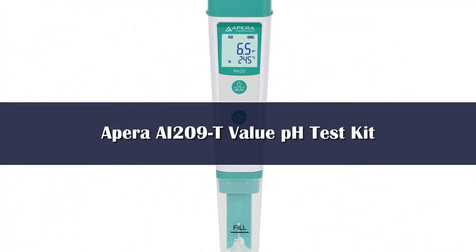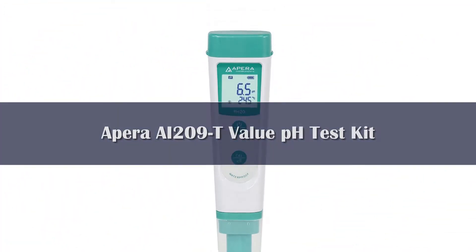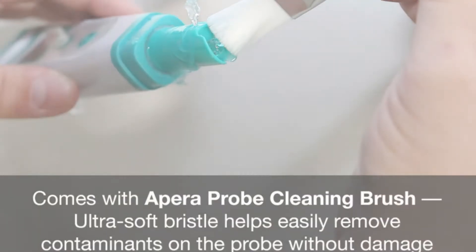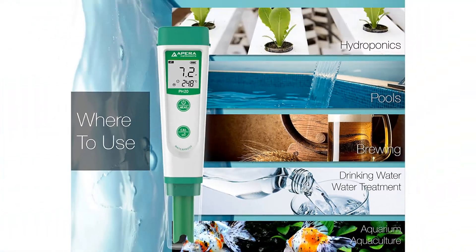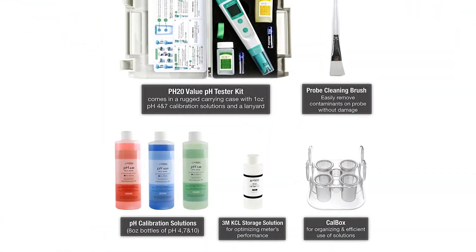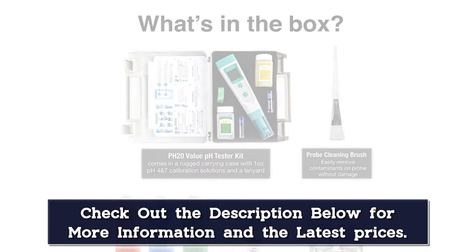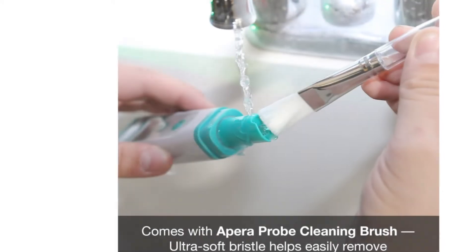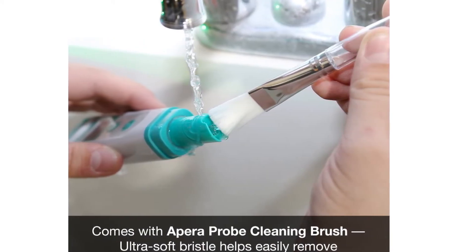Number 4: The APRA Instruments AI-209 is their value level test kit, and it's a surprisingly popular one. This pH tester for water is portable and easy to use. The kit includes all of the necessary calibration solutions to ensure accurate readings. If you're looking for something inexpensive but all-inclusive, you can't go wrong with the APRA Instruments AI-209.